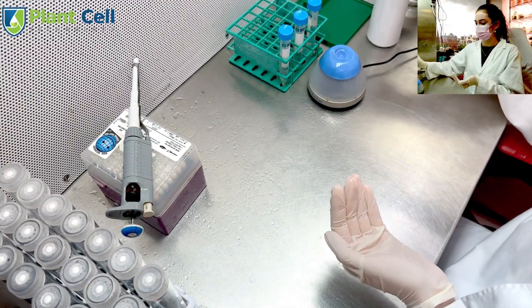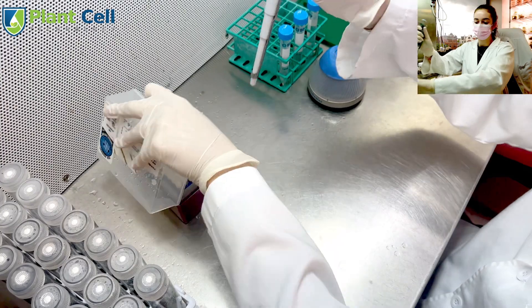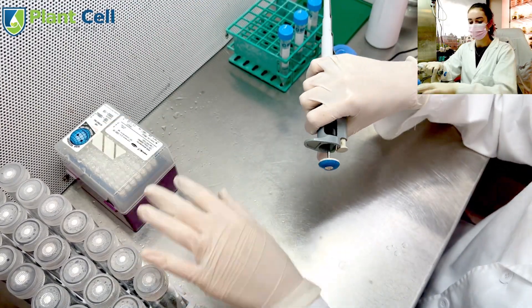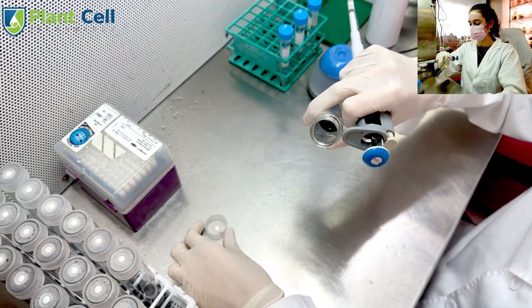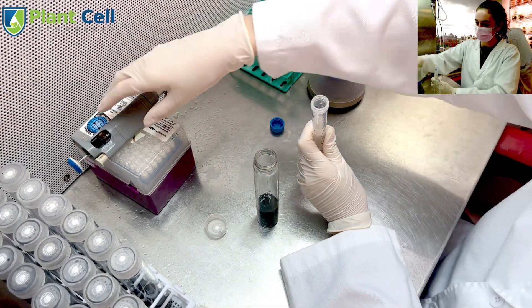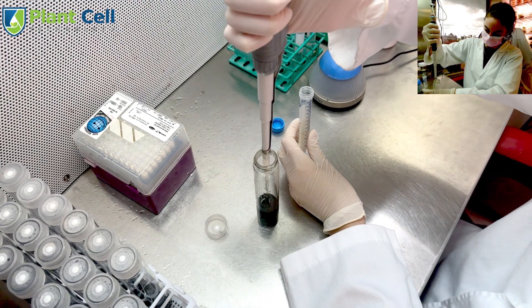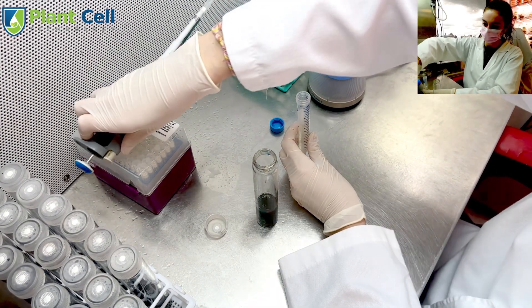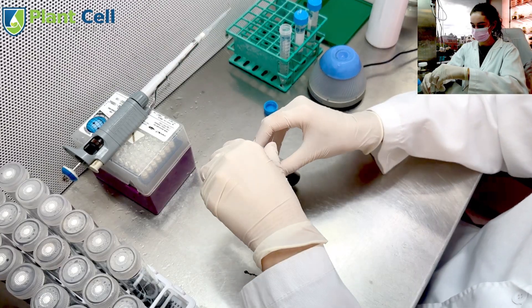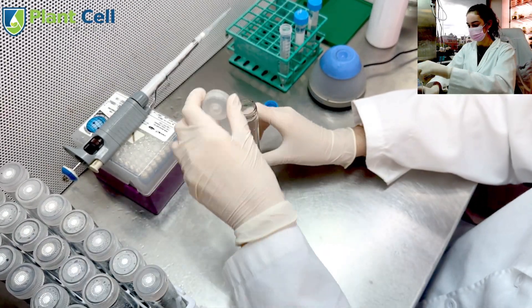Now that the media is ready, it is time to add the seeds. I begin by re-sterilizing my workspace and using my micropipet to add 1.5 ml of the seed mixture to each test tube. Make sure to first shake the test tube using the vortex and suck in and out the seeds with the micropipet before taking 1.5 ml to ensure the seeds are thoroughly mixed. Repeat for the remaining test tubes, and don't forget to mix the seeds between each tube.